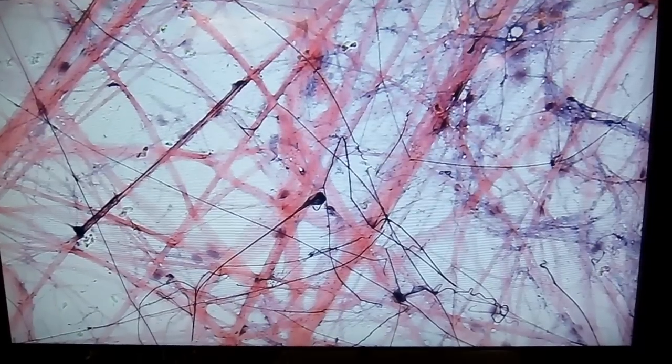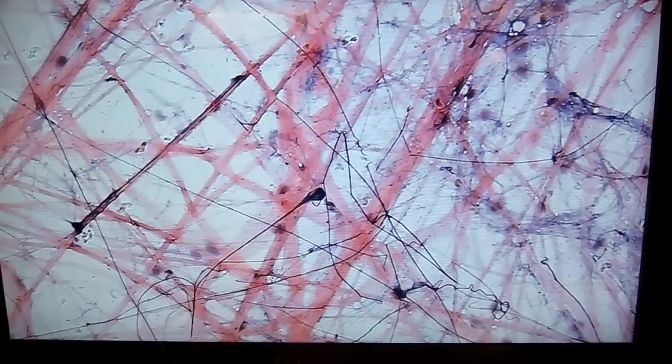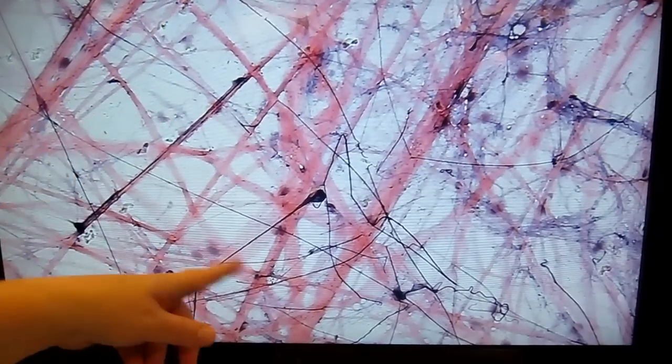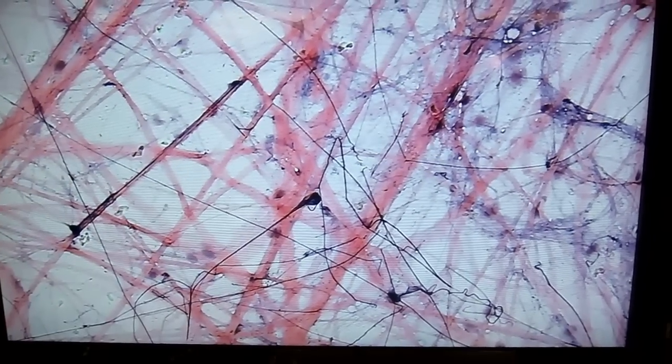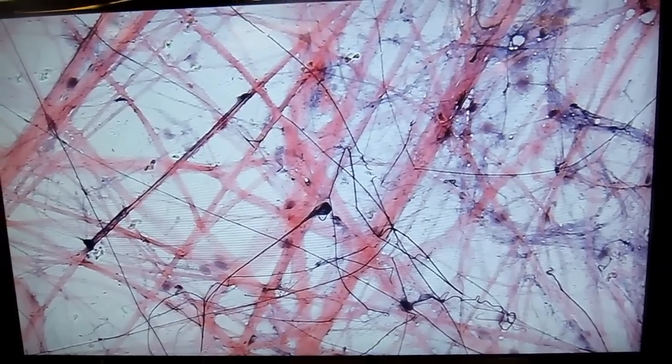And that's true. You do see a lot of fibers, but you also see a lot of empty space. And you can see some cells in here. And it's really the empty space that is the issue here. When you have empty space, it can't be a dense connective tissue. You just don't have enough fibers for it to get that designation.